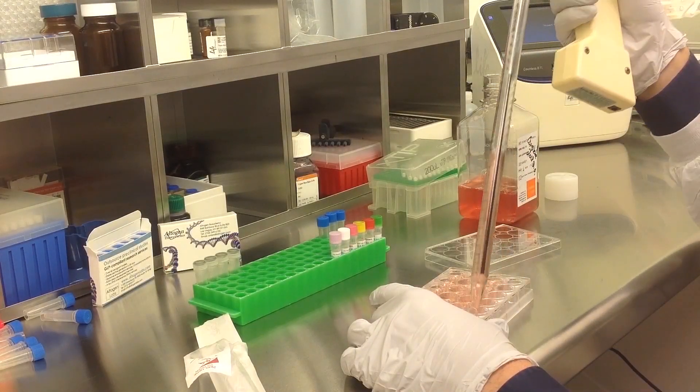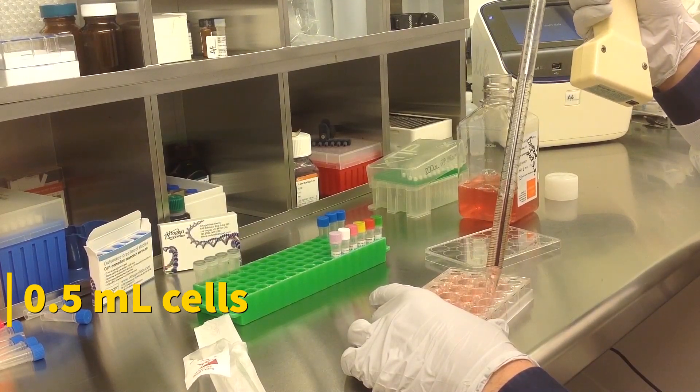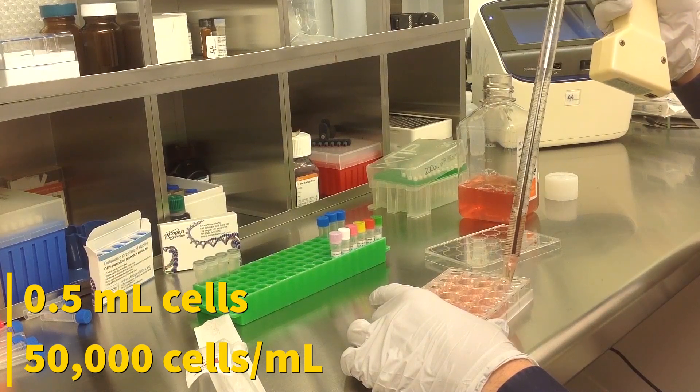Start by seeding 500 microliters of cells in a complete growth medium into the wells. Cell density should be at 50,000 cells per milliliter.